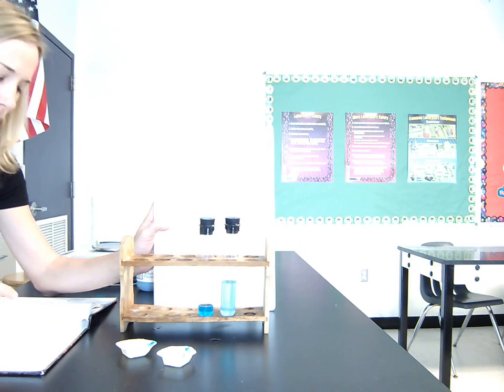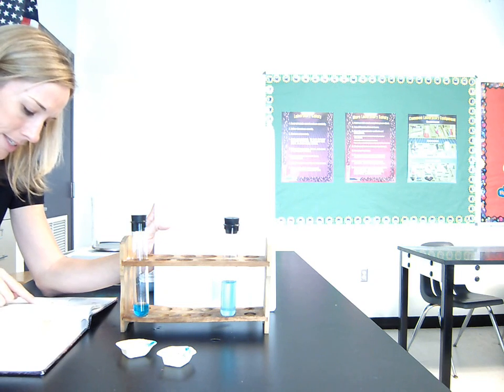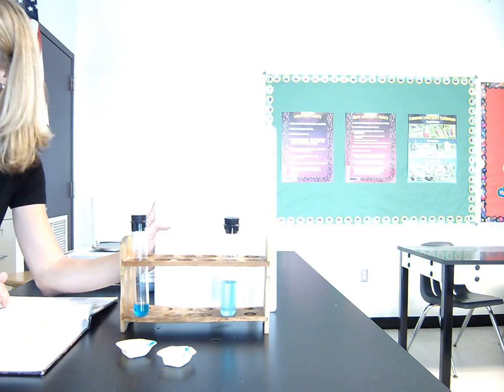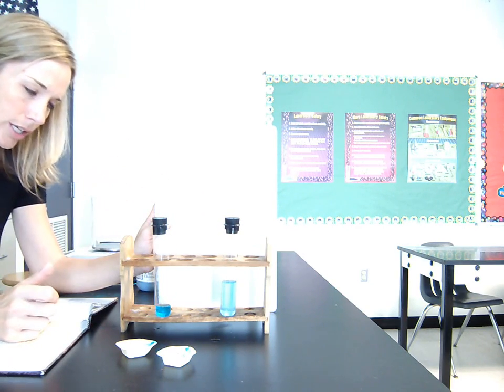The second question says, and this is a really important one. So if you're watching this, if you're taking some notes, this is one that we definitely want to pay attention to. So we're going to come back to this quite a bit. It says, do you think that each cubic centimeter of solution in one test tube, okay, so one or the other, contains the same amount of dissolved material? So let me rephrase that question for you because it's tricky.